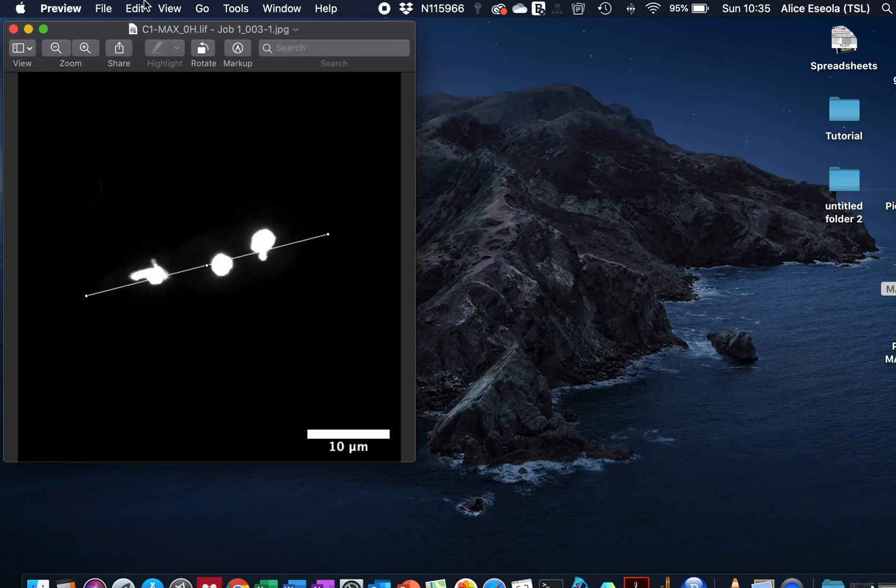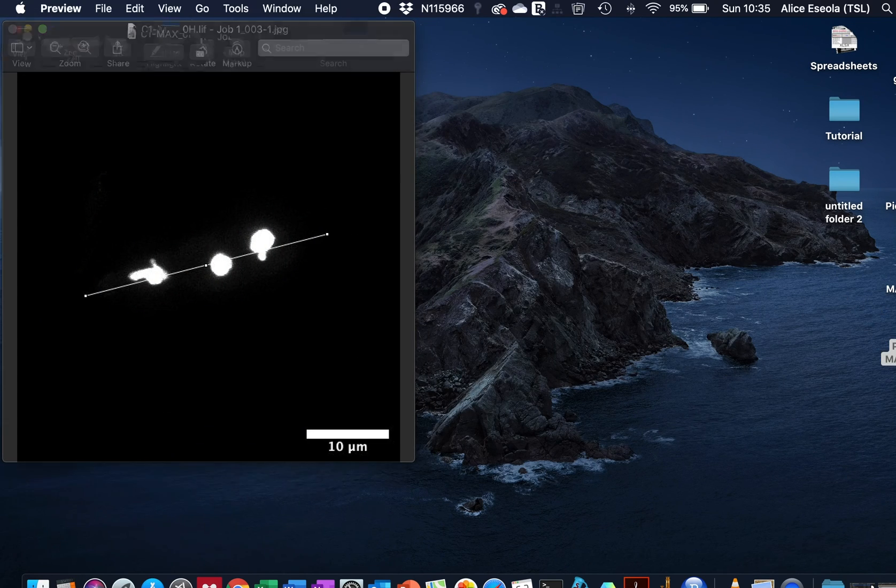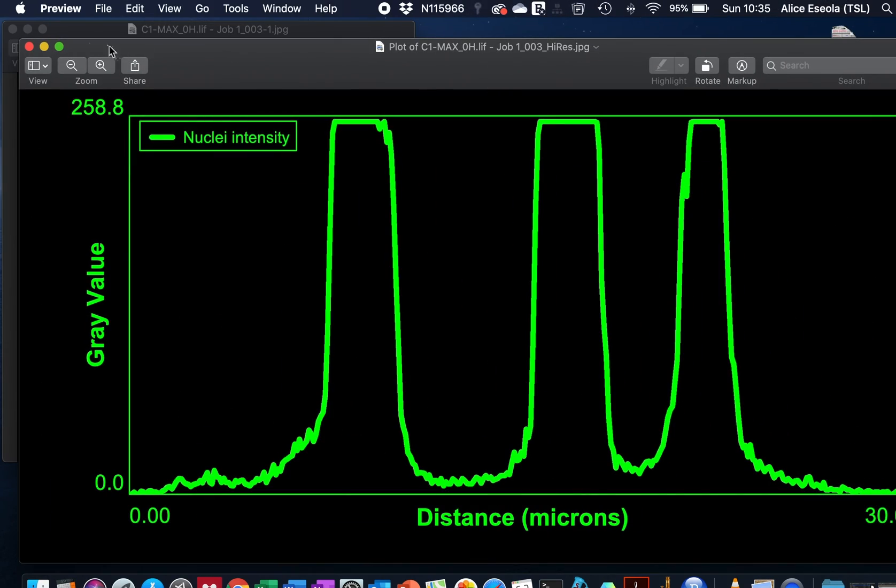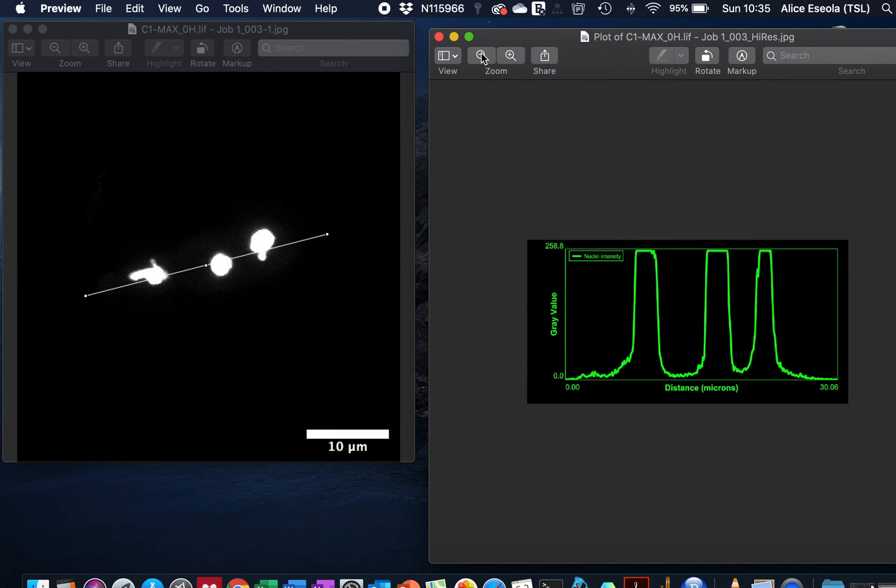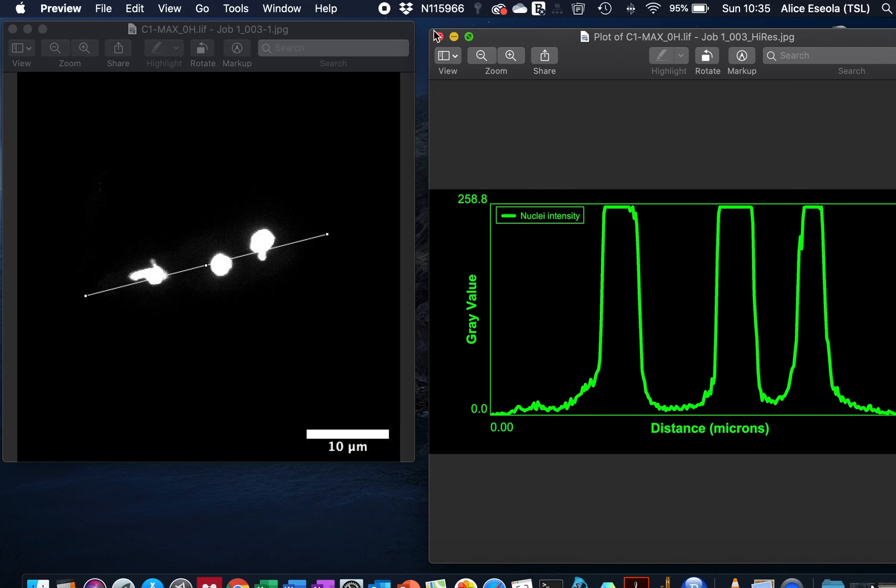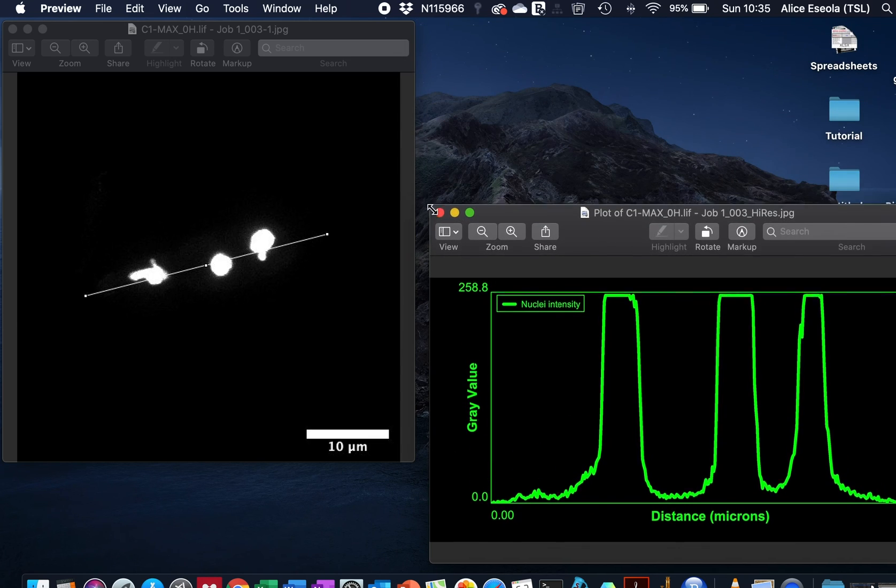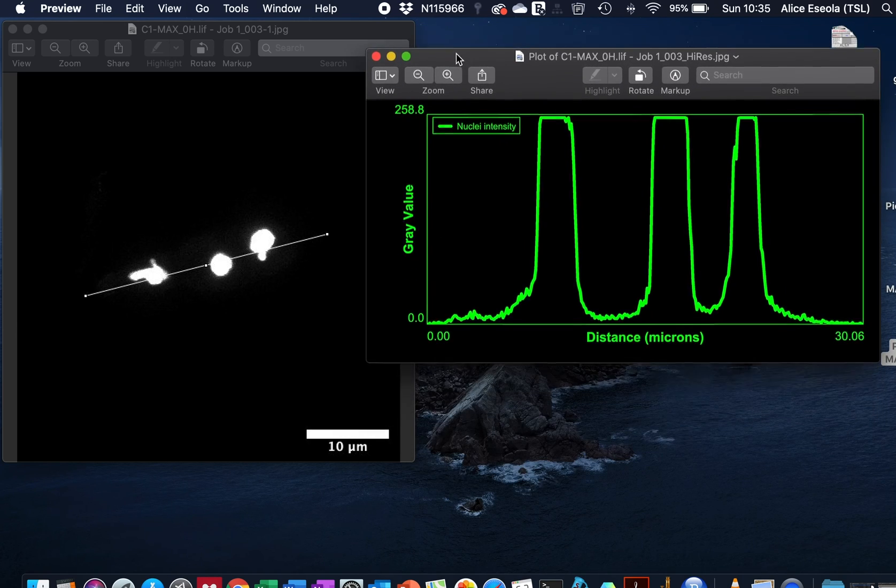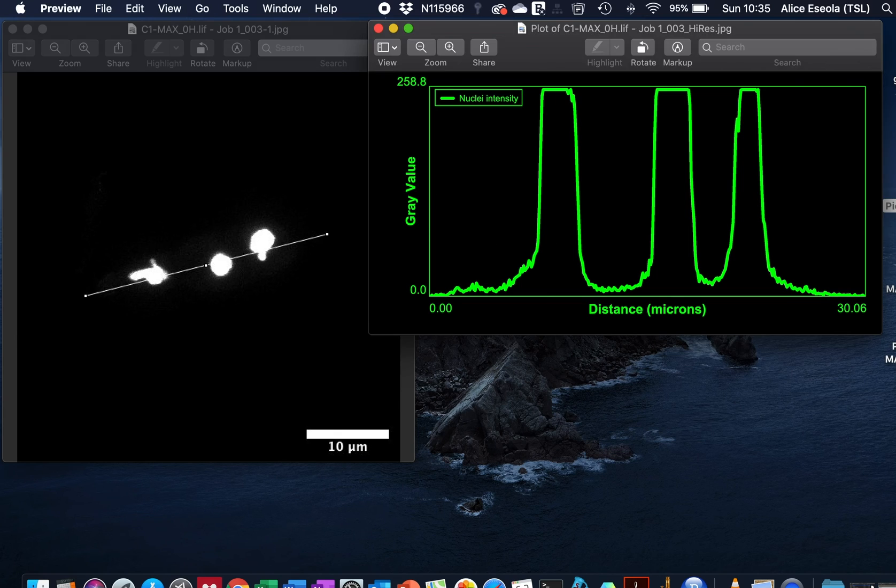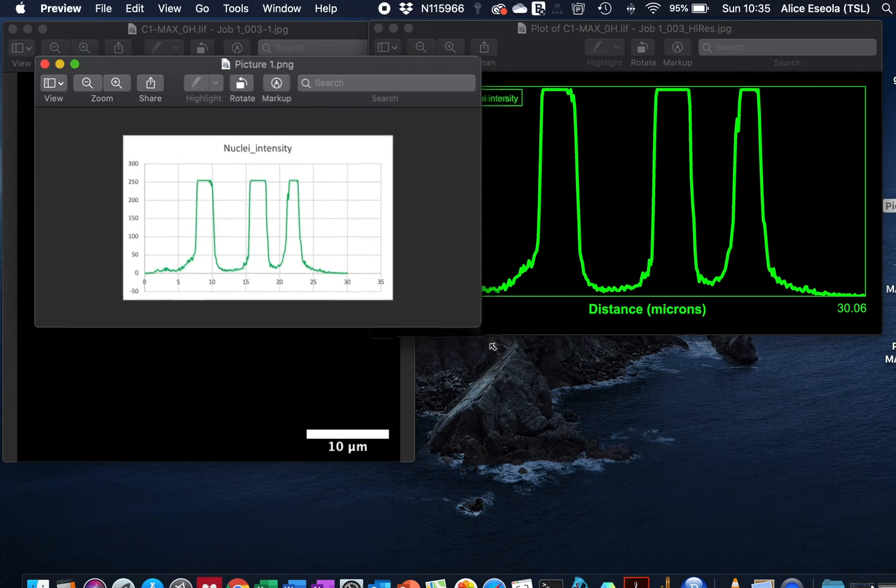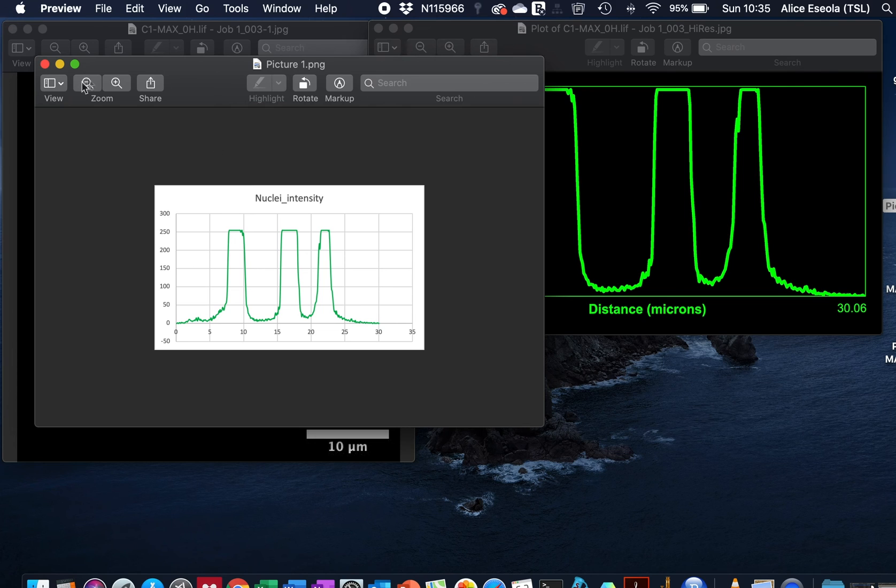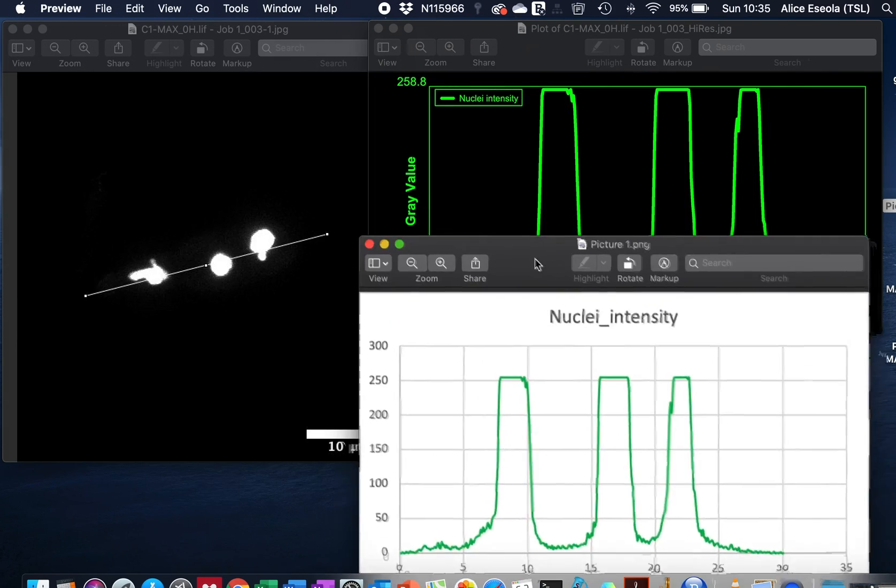So here is the sample we quantified, here is the line graph we drew with the ImageJ software, and here is the one we plotted on Excel file.